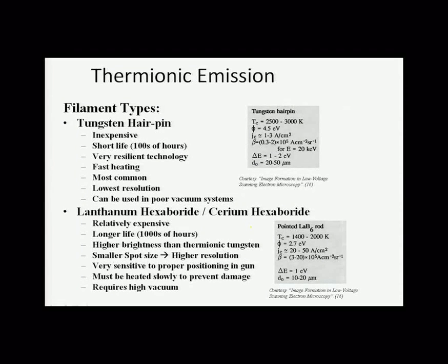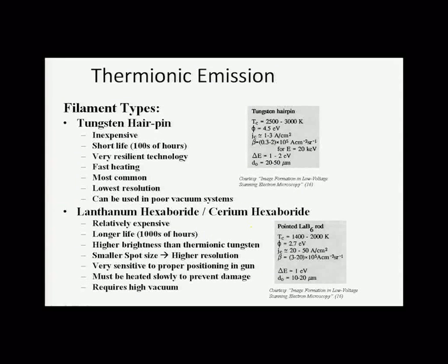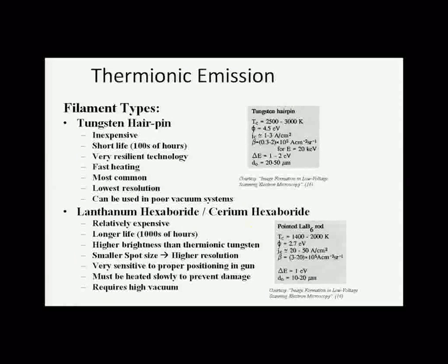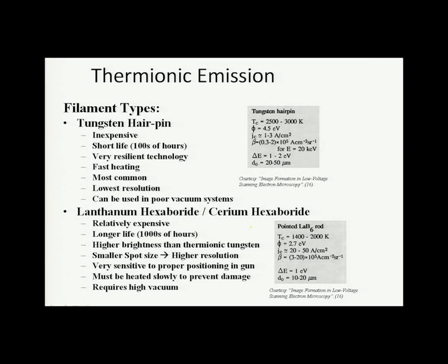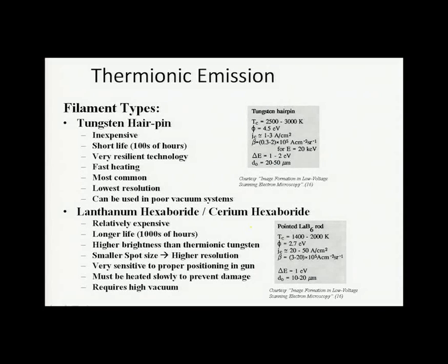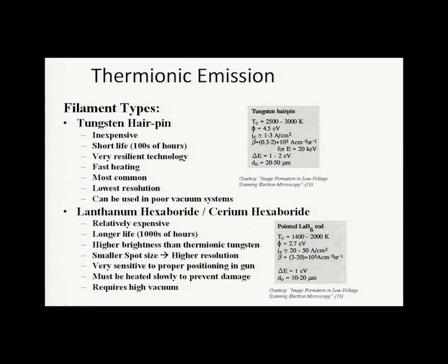The lanthanum hexaboride, cerium hexaboride types of tips are relatively expensive. They do have longer lifetimes, higher brightness, smaller spot size, but they must be heated slowly to prevent damage, and they require very high vacuum. So there are pros and cons, but definitely the most common in use in SEMs is the tungsten hairpin filament.